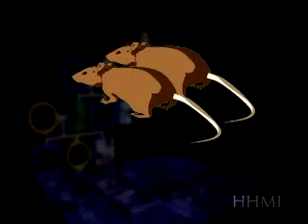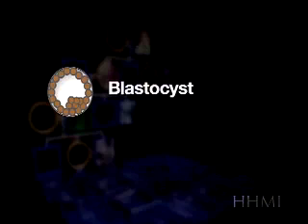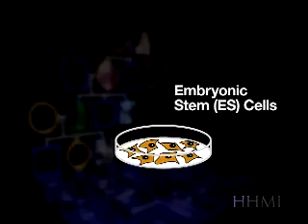In these methods, a pair of mice with brown fur are mated. Embryos are isolated from the mother after 3 days. At this stage of the development, the embryo is called a blastocyst. Blastocysts can be cultured to make colonies of embryonic stem cells, or ES cells. ES cells have the potential to develop into any cell type or tissue.